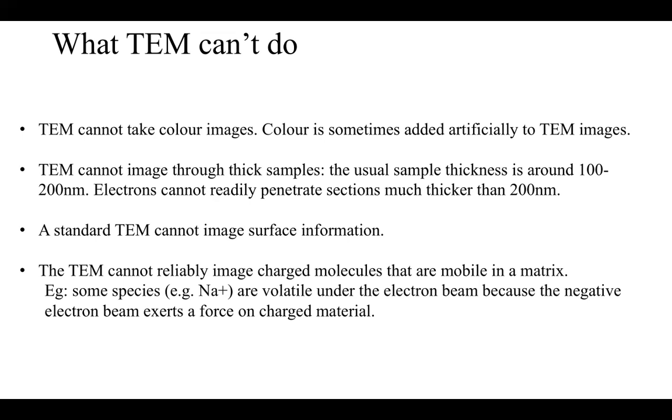And with a standard TEM, you cannot get the topographical information like SEM does, because this is basically a 2D projection. Because it transmits through the sample, there's no way of getting surface information, but you can take several images and try to compose them in a next step to get the surface information.